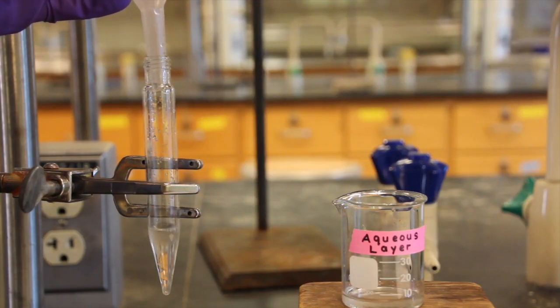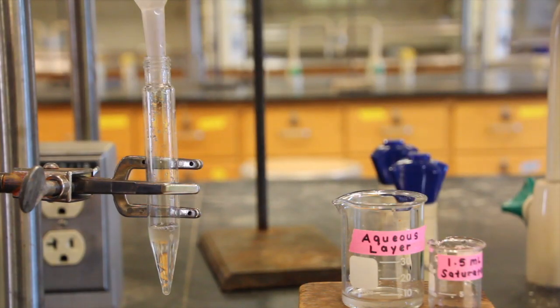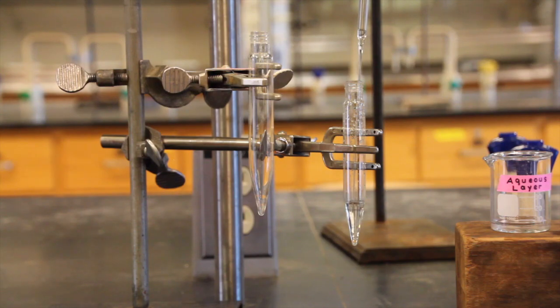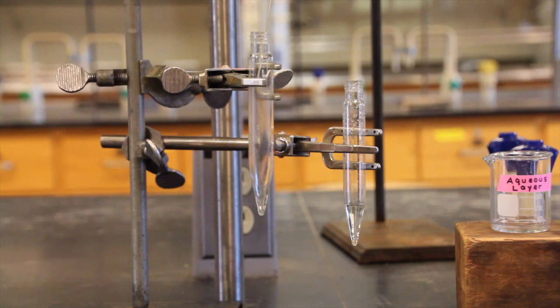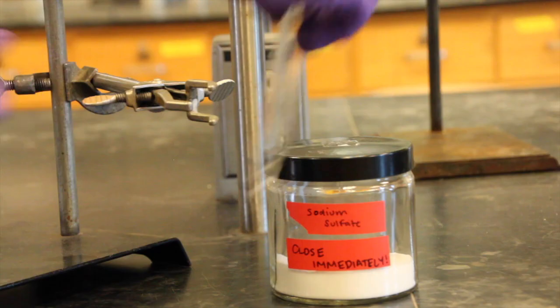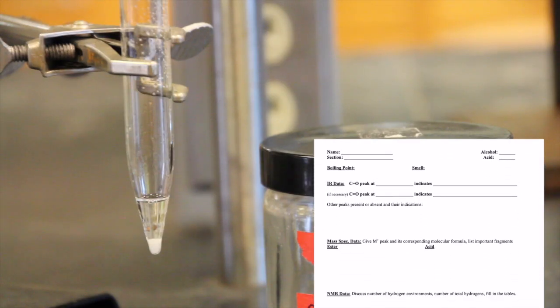Finally, wash the organic layer with 1.5 milliliters of cold saturated sodium chloride solution. Use a fresh pasture pipette to transfer the organic product to a clean, dry centrifuge tube. After you've dried the product using anhydrous sodium sulfate, analyze and confirm the synthesis of your ester.